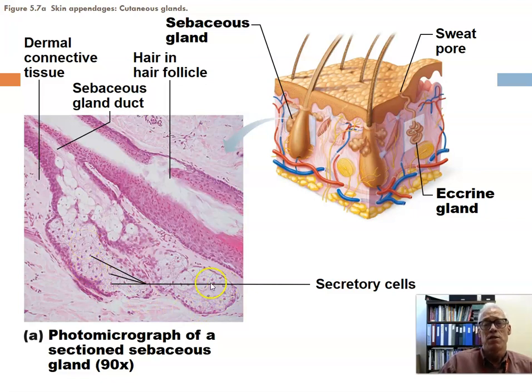The cells of the sebaceous gland are very characteristic looking. They are clear in comparison with many of the cells around them, and that's because their mucus or oil-rich secretion, I should say, washes out during the staining process for the most part. But the nuclei are very, very small, so you wind up with this really clear, hollow-looking space with a tiny dot of nucleus. So that's the peculiar look of sebaceous gland cells, and they produce the oily secretion that enters the follicle and then emerges onto the surface to lubricate the hair and the epidermis, the surface of the skin.